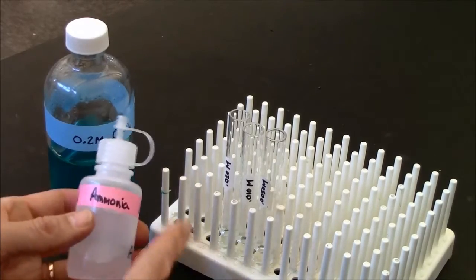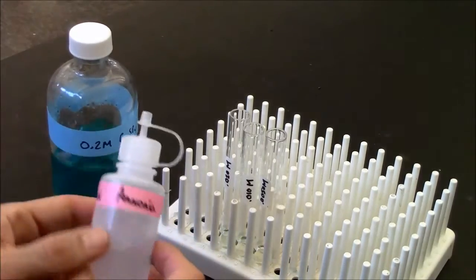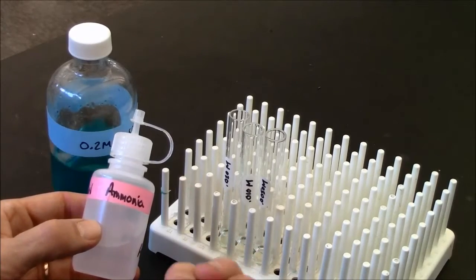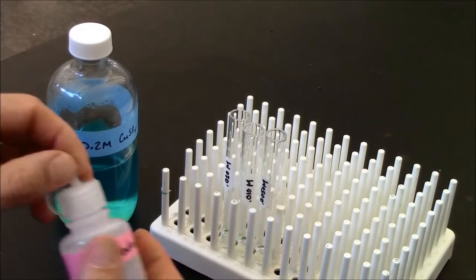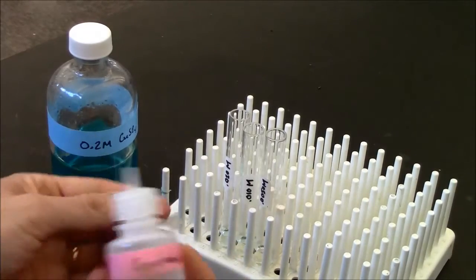Ammonia will react with copper ions to produce a very vibrant blue color. So let me show you how this works. I'm going to test for copper ions in here, and we'll look at the color that's developed.